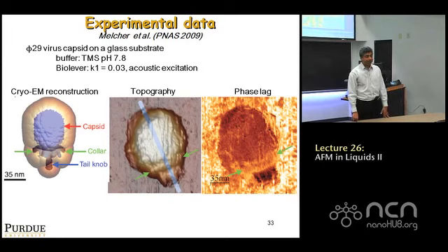Absolutely. A lot of AFMs have humidity control chambers. In the cases, everything we're doing in biology has dealt with having a chamber in which the sample is completely immersed in water and the cantilever also is immersed in water. There are, of course, a lot of applications where you don't want everything immersed in water. At the same time, you do want to study the effect of humidity. What humidity typically does is it grows a native layer of water on your sample, and the extent of it depends on the humidity control.